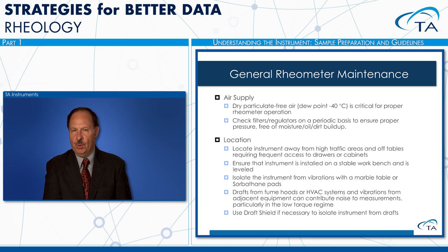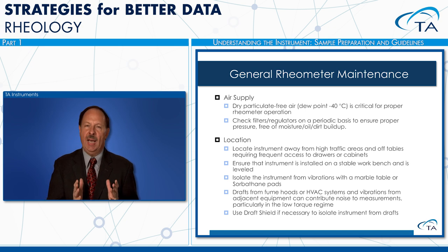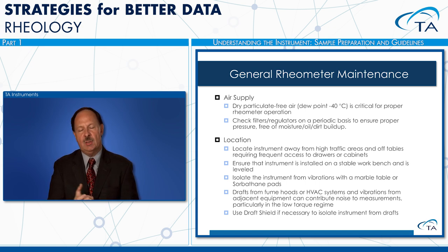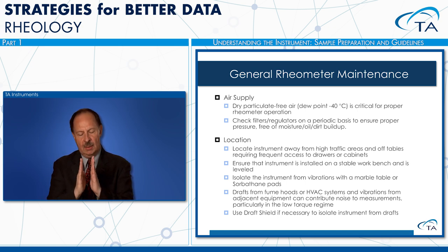So when you actually set up your rheometer, a couple things to keep in mind. Rheometers, a little bit like people, need air. They need air to breathe. So we need to get a nice clean air supply into the rheometer. When our service technician does the installation, he will also install a filter system, whether it's an Aries or a DHR. You'll have a filtering system that will catch some of the extra oil and moisture particles that we don't want getting into the rheometers. One of the developments with the DHRs is that the gaps between the walls have gotten bigger, so there's less of an issue of contamination due to any particulates that might work their way through. We hope that never happens, but with the current design that is less of an issue.